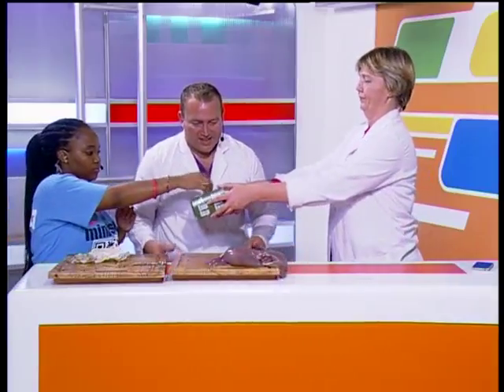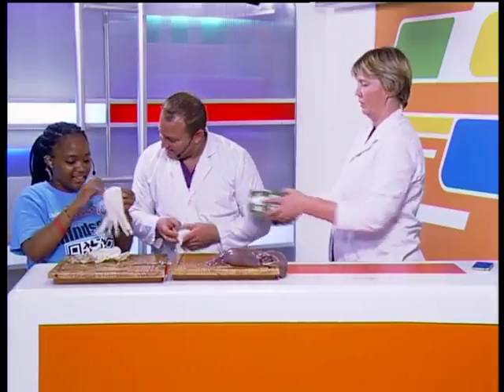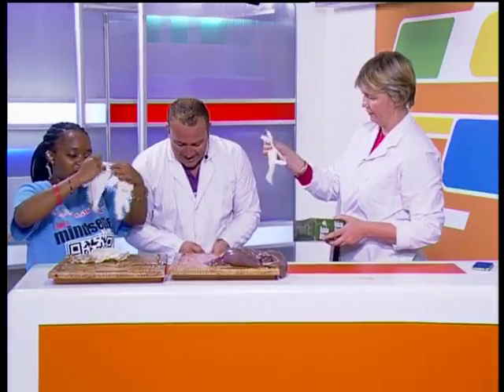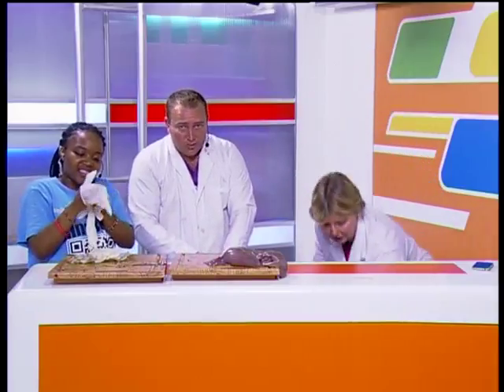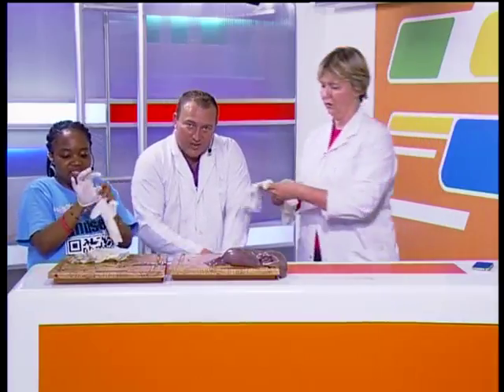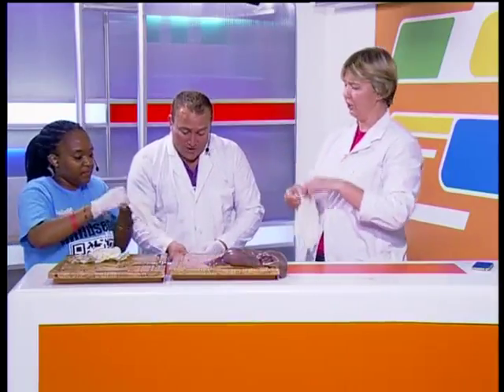Let's pull it across. And it is this beautiful thing called the liver. The liver. Livy the liver. Now, we eat the liver, yes, which is quite cool. So we actually do eat the liver. We have a lot of fun with the liver. I feel like a doctor when I do this.